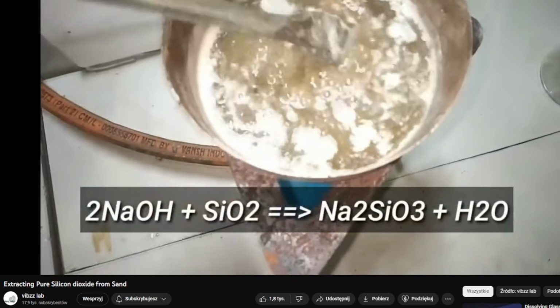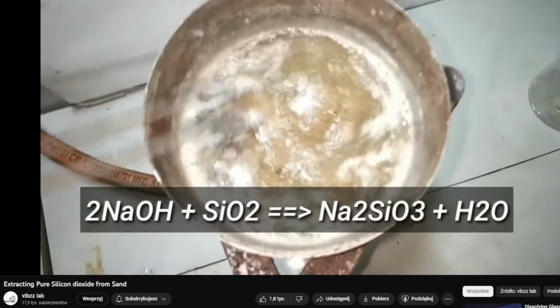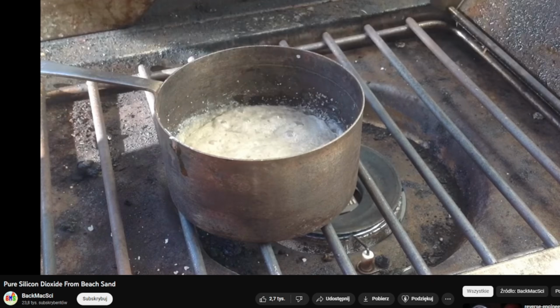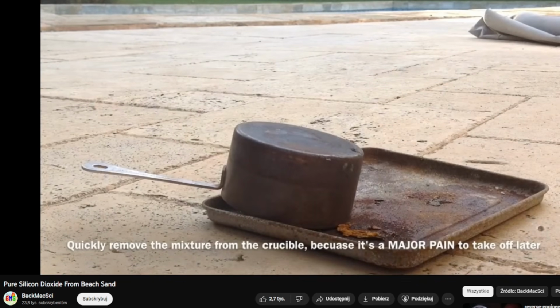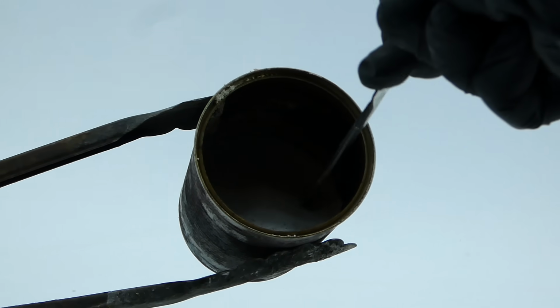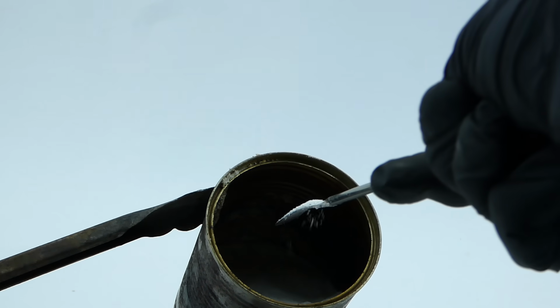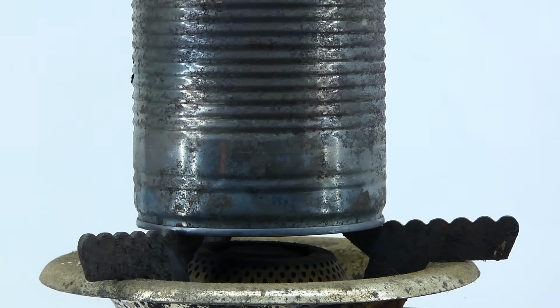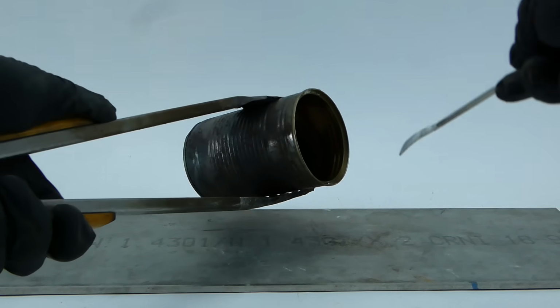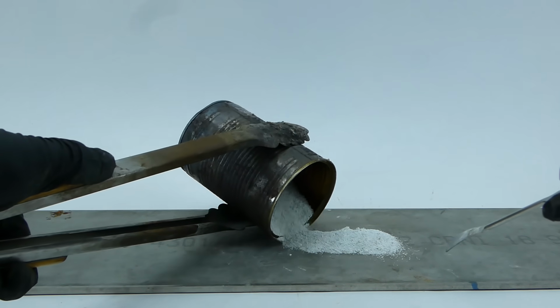When I watched videos of other people doing this reaction, the ingredients always melted, creating a kind of slurry that then hardened upon cooling. My reaction mix just stayed as a powder, and even when the can got red hot, it didn't melt. After a few minutes of vigorous heating, I got it off the heat and spread it on a piece of metal to cool.